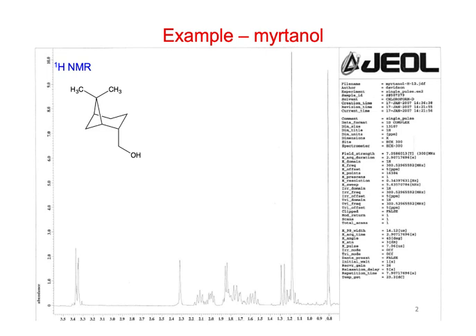So if we look at the proton NMR, there's probably just a few things we could pick out. What do you think we could identify here as far as assigning some peaks?